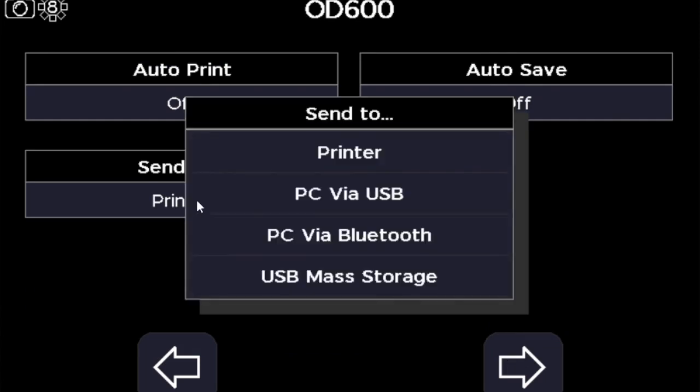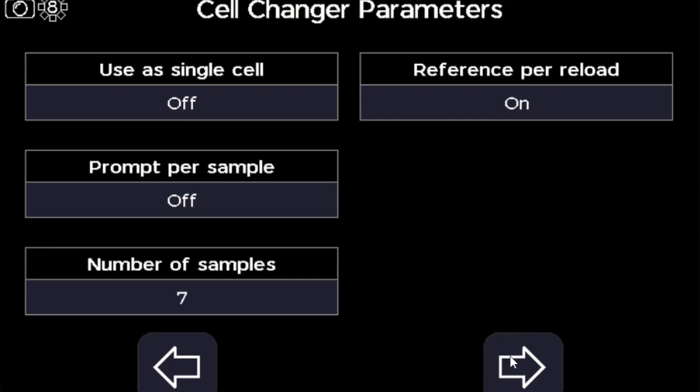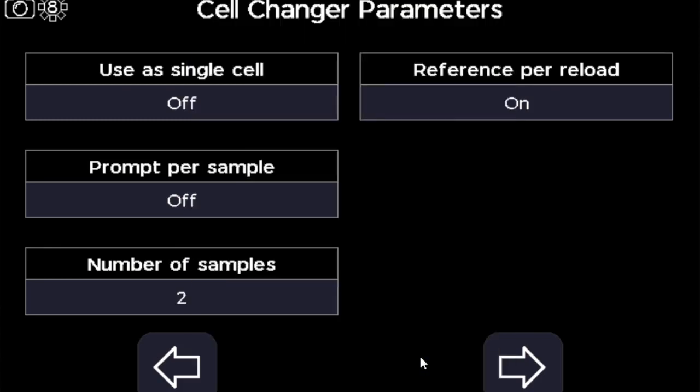It will then give you options for how you want to save your results, and then take you through to loading your samples via the cell changer. I'm going to load in two samples and one reference here.